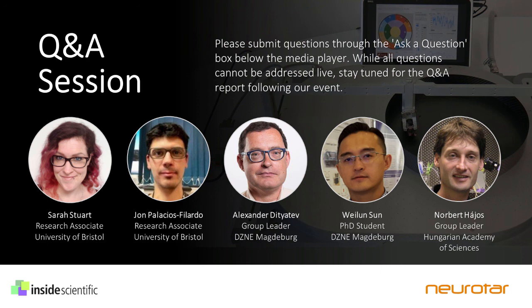So with the sniffing, I think the angled clamp that we use definitely provides a huge improvement in terms of allowing the animal to sniff and whisk the environment as if they were freely moving. With the grooming behaviors, the mice are able to carry out face grooming, but because of the head fixation clamp, they're unable to do a full body groom while they're in the mobile home cage. But what we've noticed is that on most occasions they'll carry out a full body groom as soon as they're released from the clamp. We haven't looked at sleep specifically in the mobile home cage.